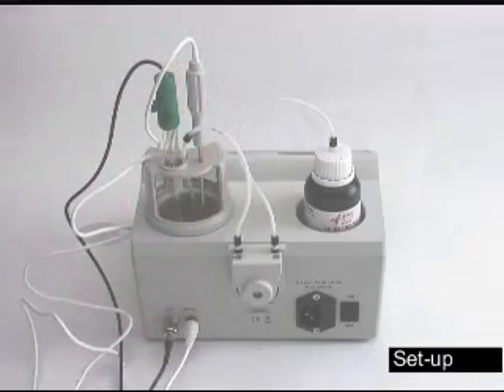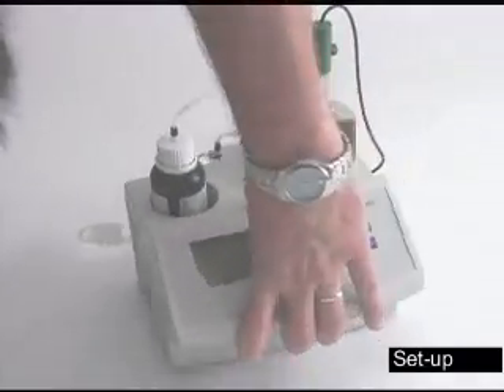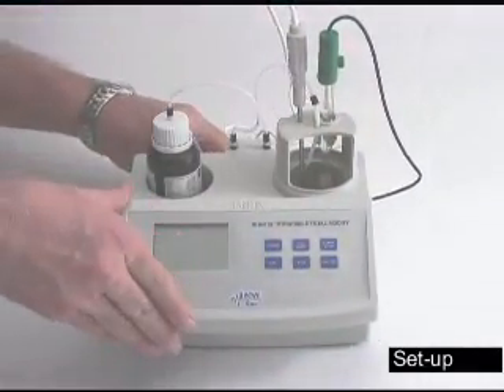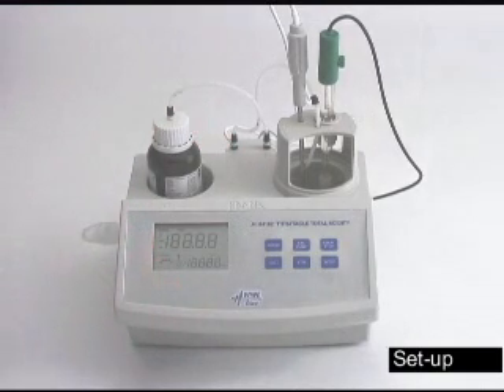Once you have all these hooked up, turn your meter back around, plug it in, and hit on. The machine will go through a quick self-diagnostic. When it's finished, it will display four dashes across the screen.